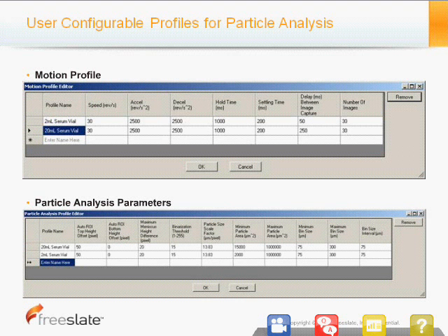You can see there are some differences here between the 2 milliliter vials and the 20 milliliter vials. The main difference is actually the delay between image capture. When you have a larger vial, things are moving around a lot faster. So in order to detect the particles, you can have a much larger delay. The fluid motion doesn't decay as fast in a large vial, and so you can have a longer time period between acquired images.